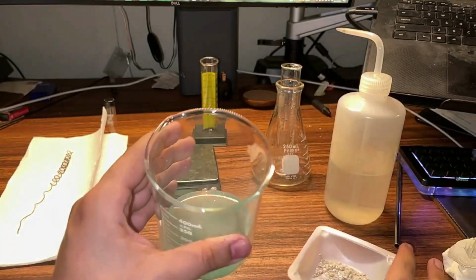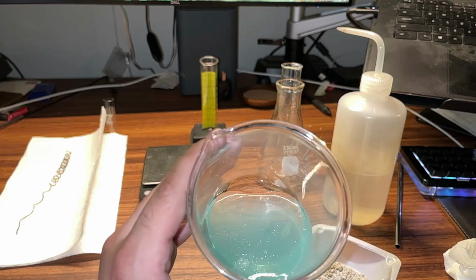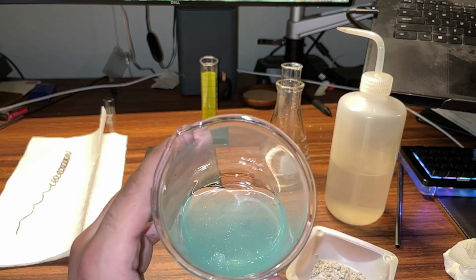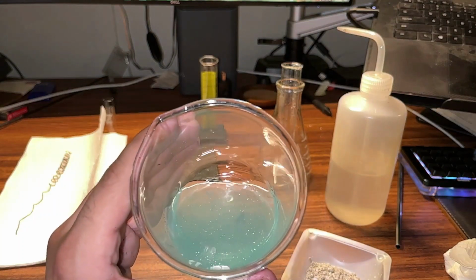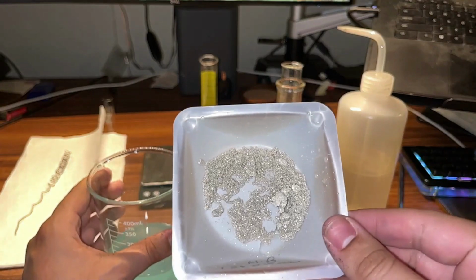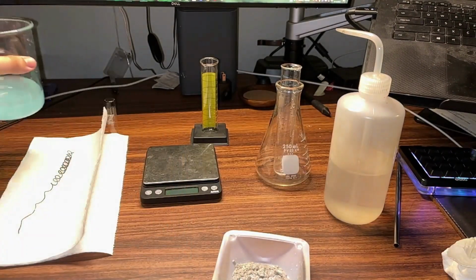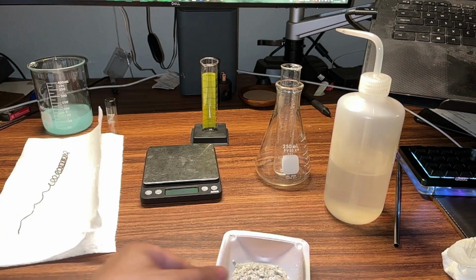Cool. Now you can probably see, especially with the light, that there's some silver particles floating around in there, but honestly, because they're so tiny, their mass is negligible. We don't really need to worry about those. Look at how much is there, right? That's a lot of silver, and that's really pretty, actually. It's one of the best results I've ever gotten. And I've done this reaction probably more than 10 times, maybe 20 times.